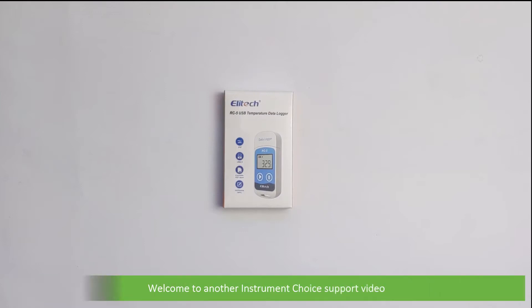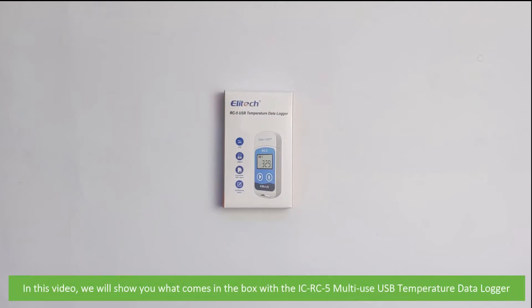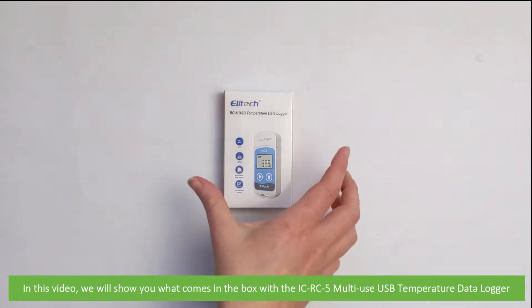Hi and welcome to another Instrument Choice support video. In this video we'll show you what comes in the box with the ICRC5 multi-use USB temperature data logger.